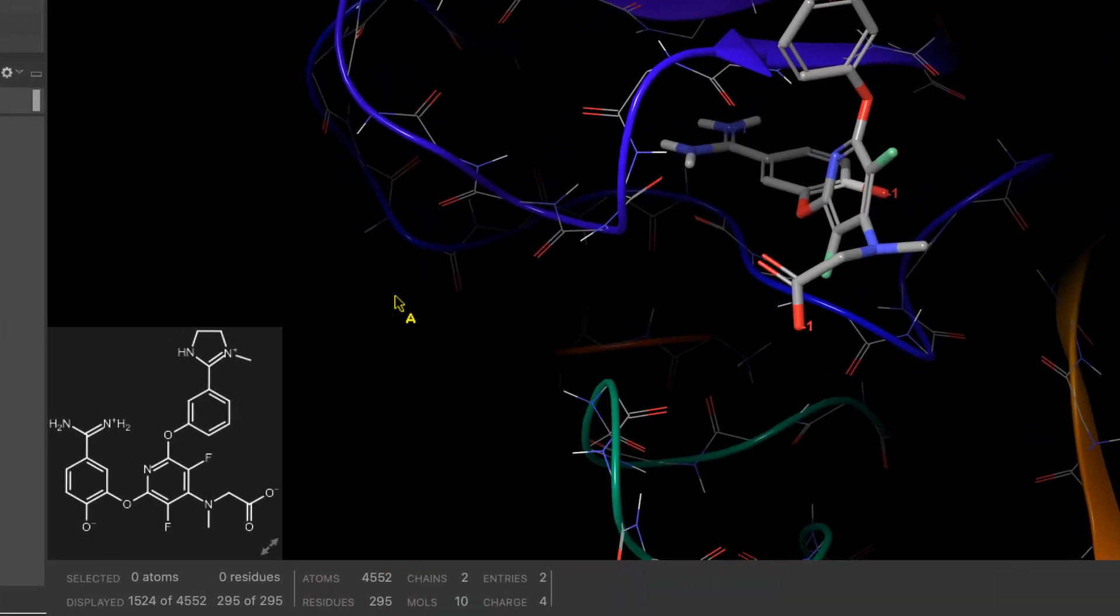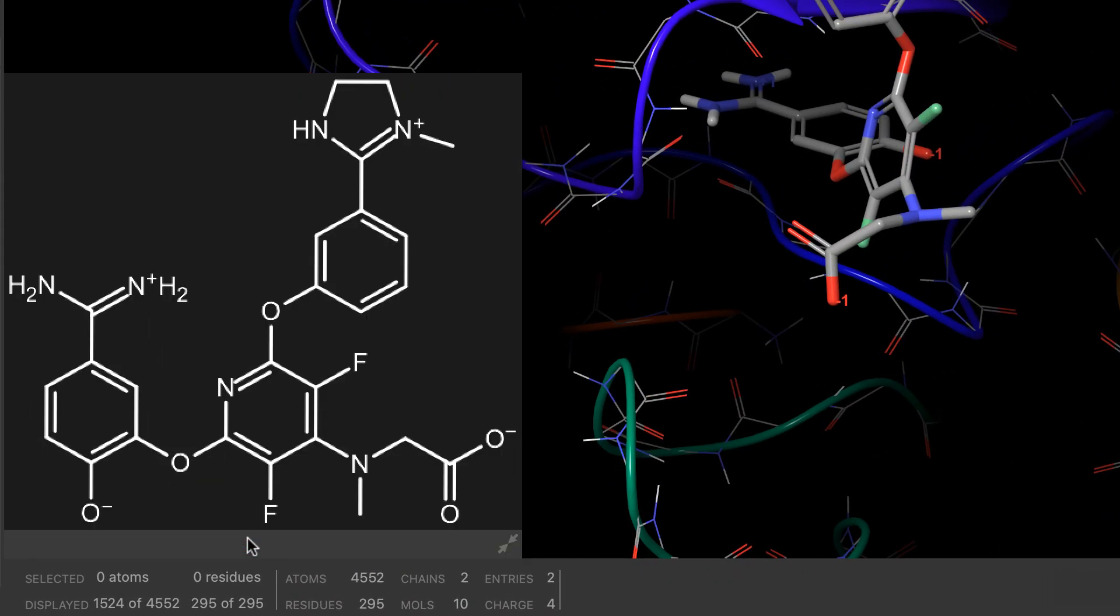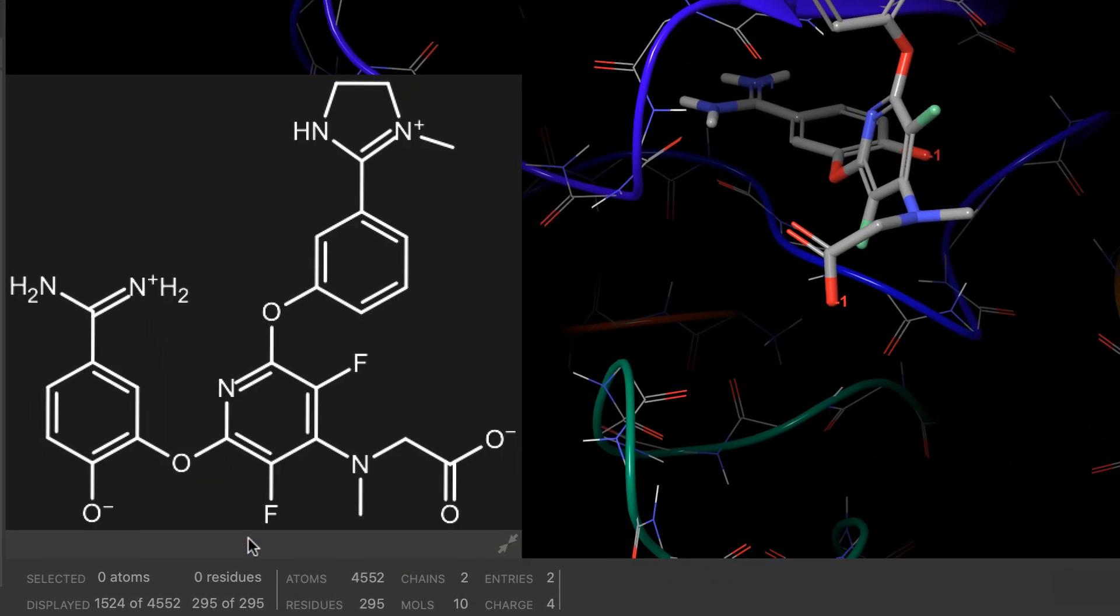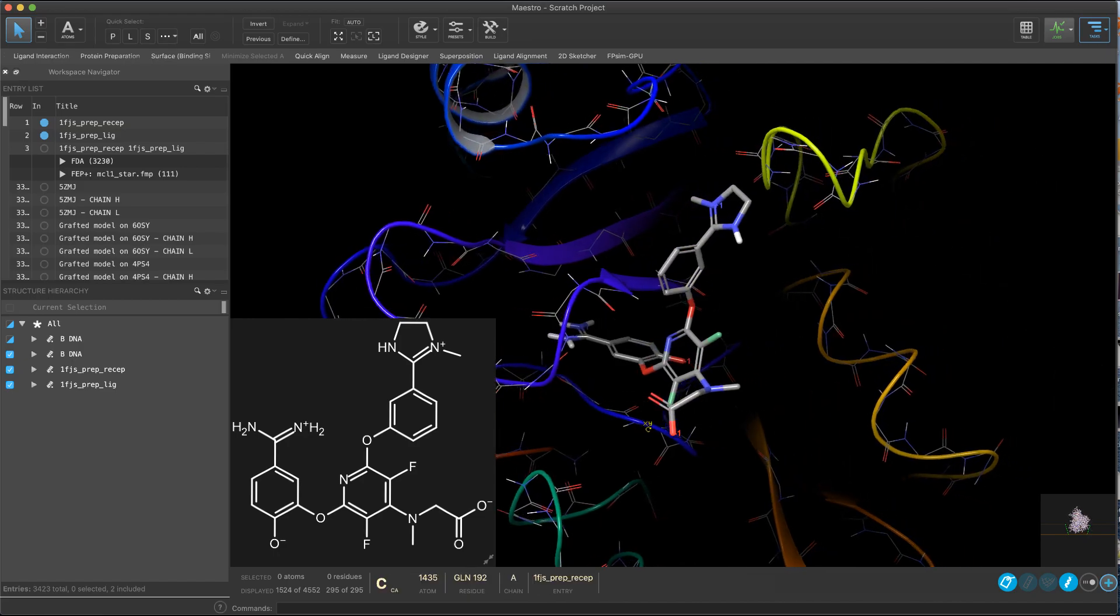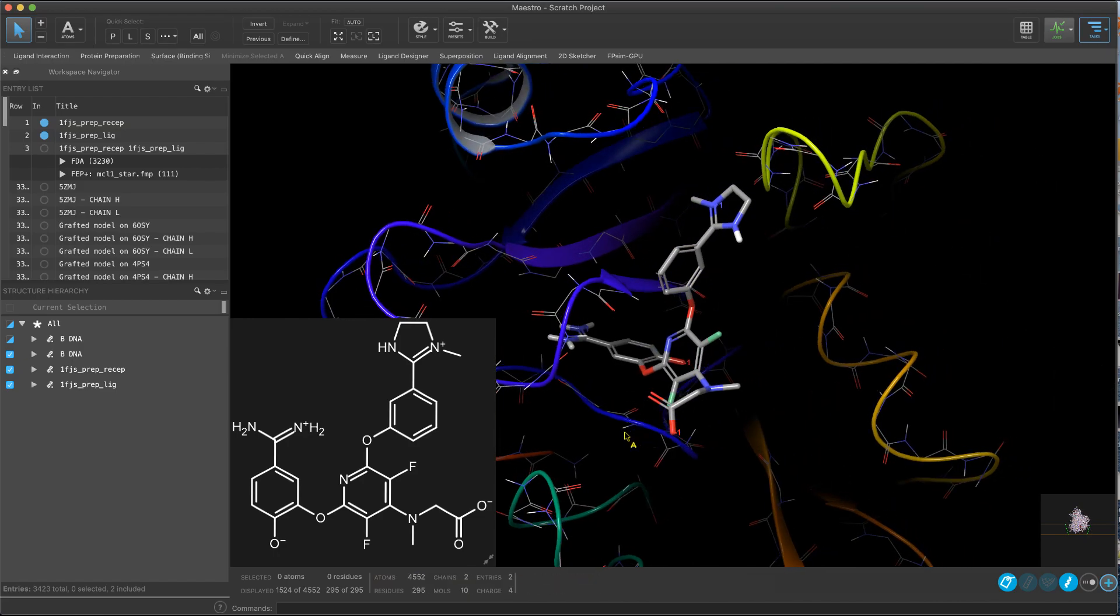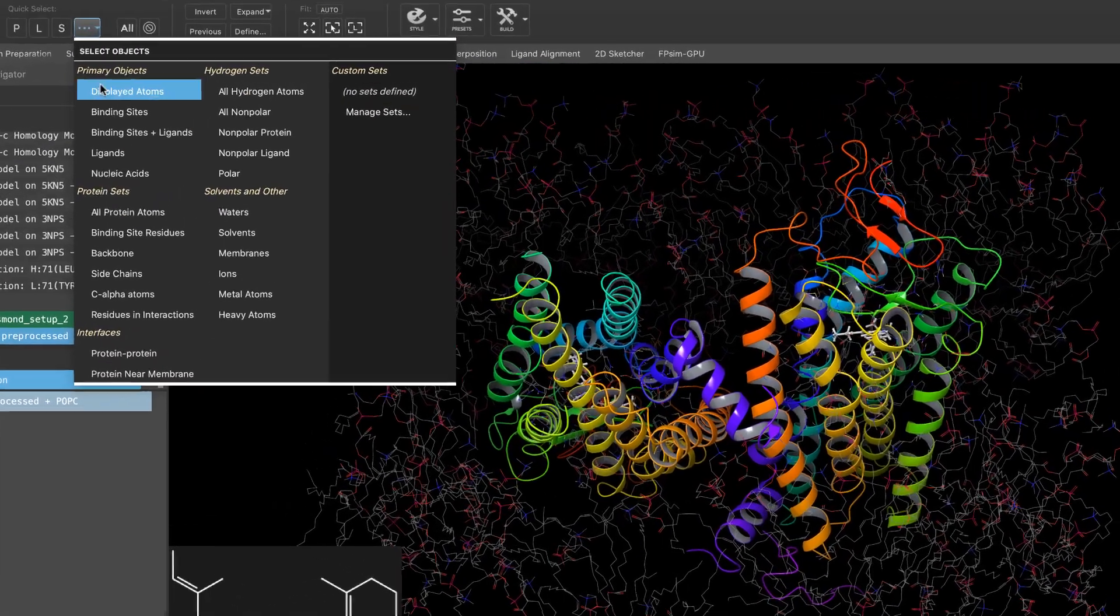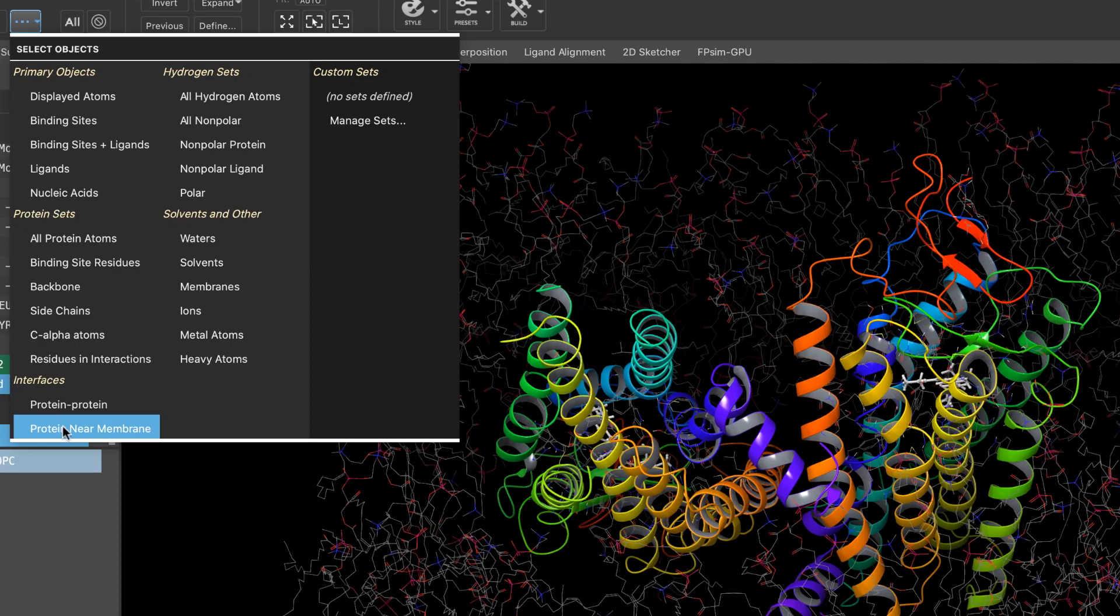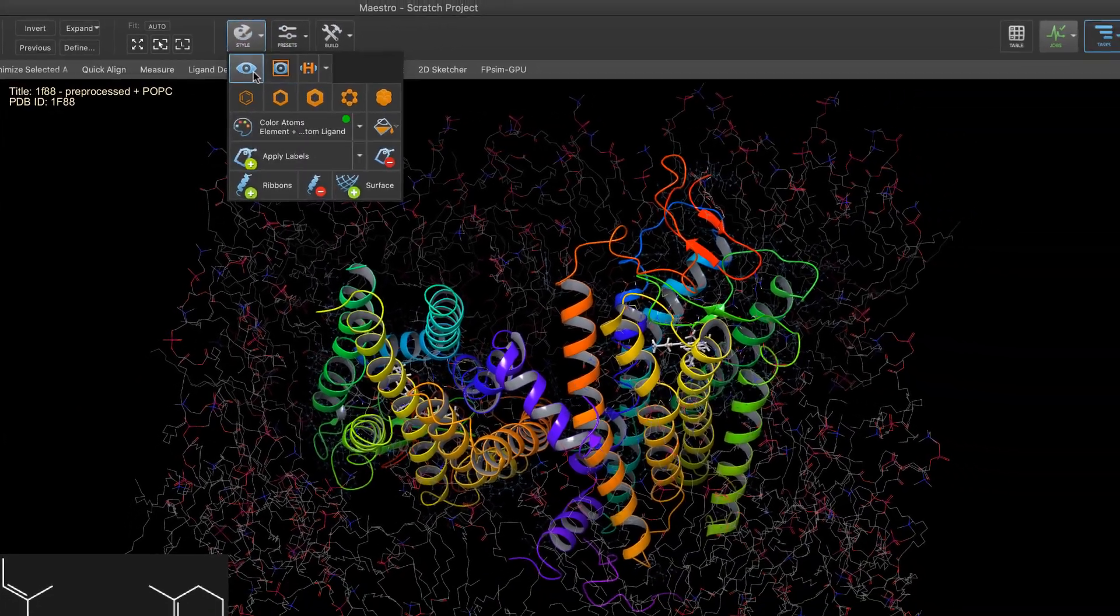Also in Maestro, we see the 2D overlay can easily resize to enlarge the display of the 2D structure in the workspace. And a new quick select object is available for quickly selecting residues at the protein membrane interface.